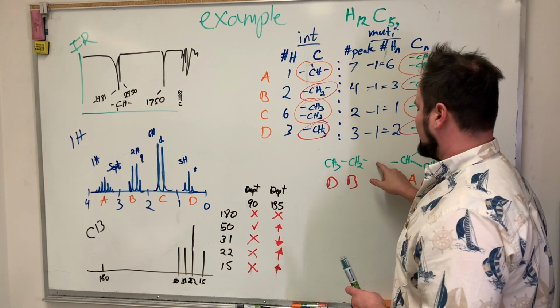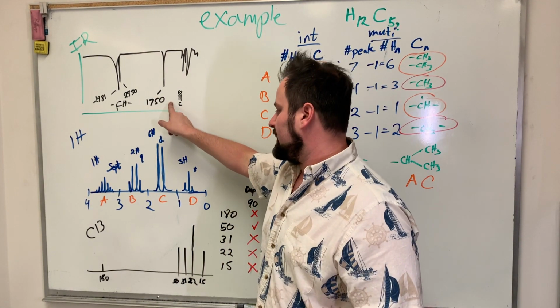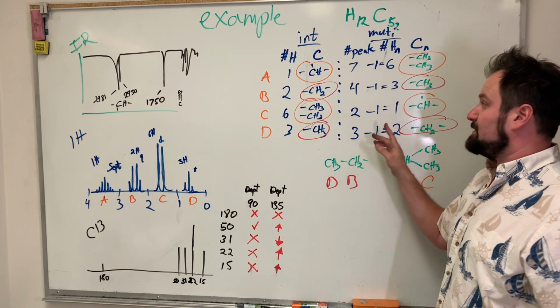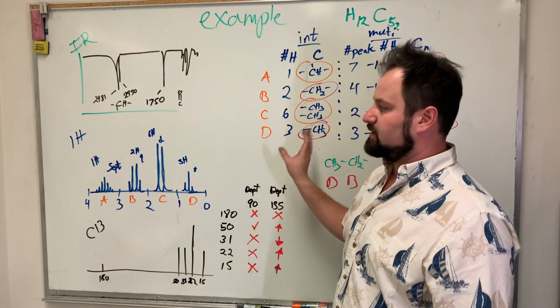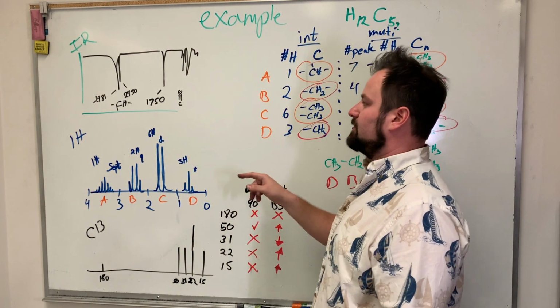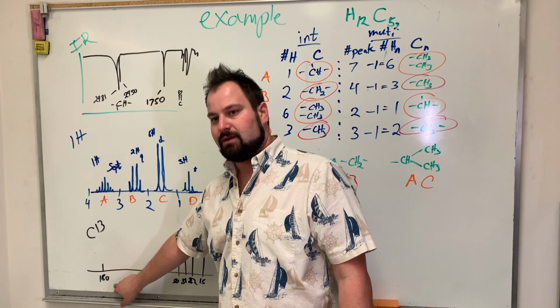So at the moment, it looks like there should be something else here because we know we have a carbonyl. Carbonyl wouldn't show up here, especially unless it was a carboxylic acid. We don't have anything to be a carboxylic acid or an aldehyde, as the other one's carbonyl. So it's not that, so it has to be some other kind of carbonyl. So that carbon, we can see here, we also have something that looks like a carbonyl.